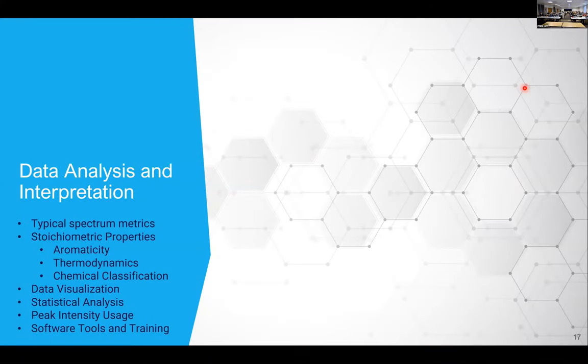So with that, we've got to the end of the data processing step. I wanted to show you that to really stress some of the key caveats or considerations with it, but remind you that most of the time, MONet is going to do this for you, and what you're going to get out is something like that last slide. In the next section, we're talking about data analysis and interpretation. So what do you actually do with that information?